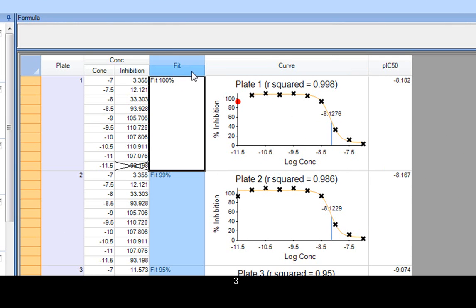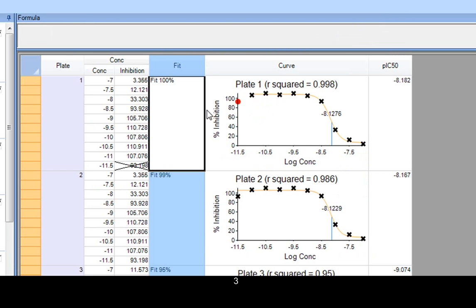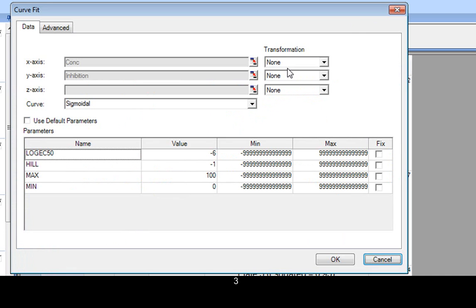And if necessary, we could go into the fits. And we could lock the parameters. We could even change the type of curve. And we can do that for individual cells as well.